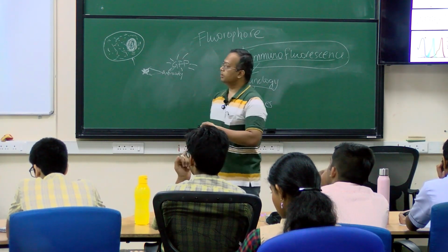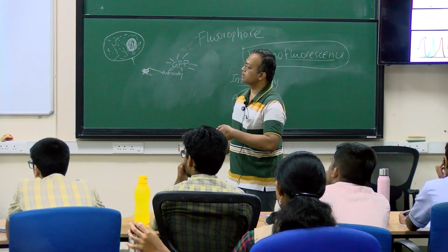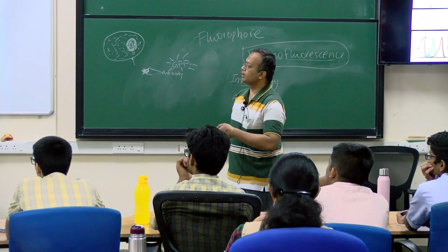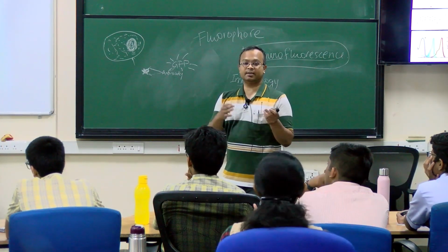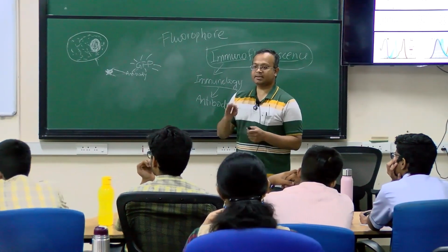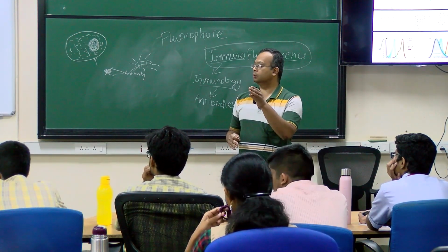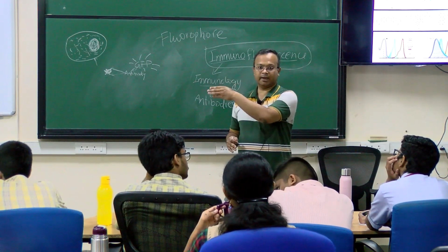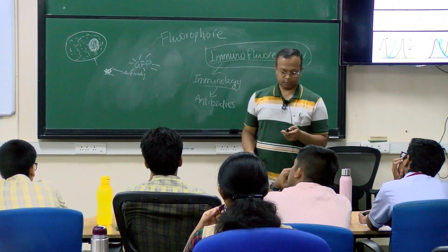Okay. So for example, if I say that I want nucleus in this DAPI, okay, so you shine this DAPI, but there may be another dye which is also very similar to DAPI, okay, so it will overlap with DAPI and it will simultaneously excite both of them, so you cannot distinguish it easily. Okay, so it is necessary to have some degree of separation, blue, green, red, or blue, green, orange, or green, yellow, red, something like that. Okay, so you have to choose your dye accordingly.